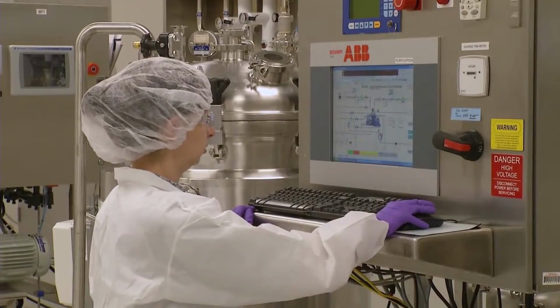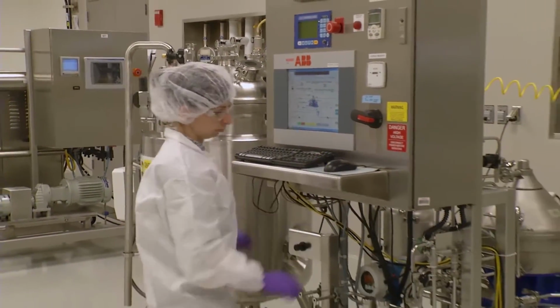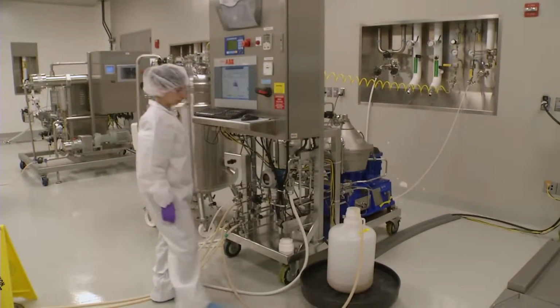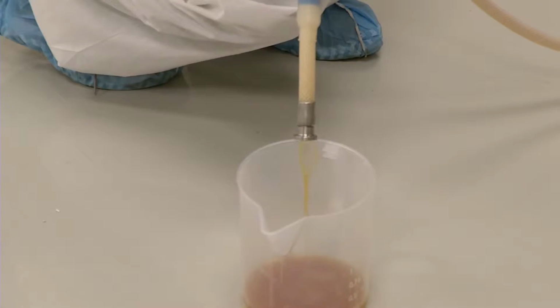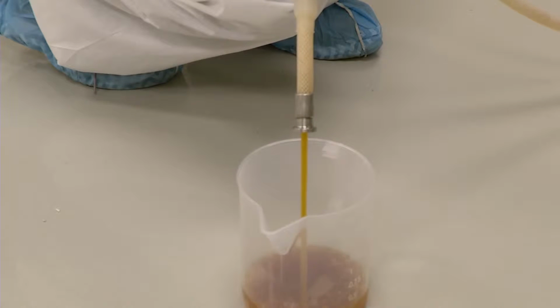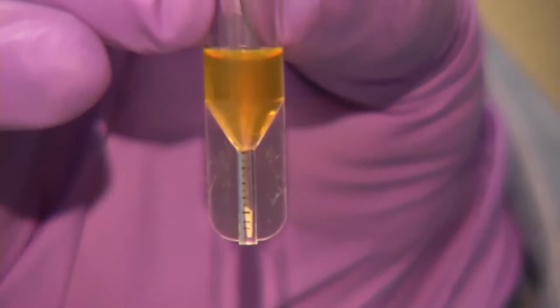The centrifuge has an integrated RPM monitor. If the unit is not rotating at a stable running speed, the controller will alarm and shut it down. The liquid leaving the bowl is known as the clarified stream because almost all the solids have been removed. A sensor monitors the clarified stream for percent solids.